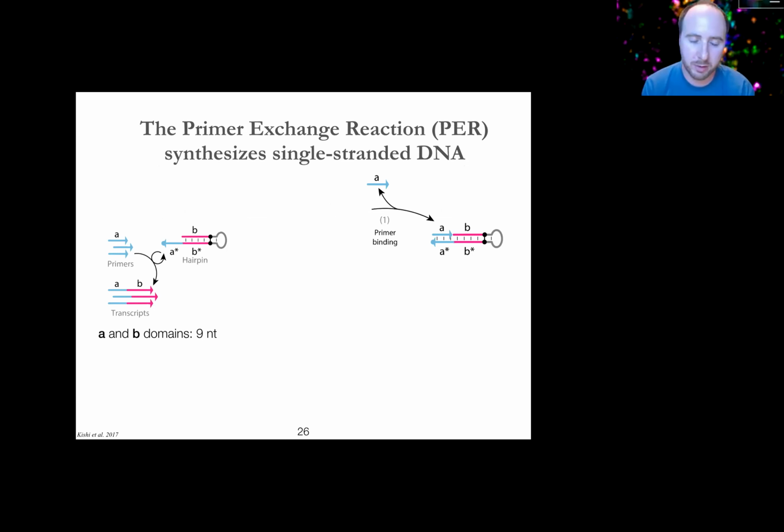And in order to explain the SABER acronym, for those of you that haven't seen Sidam's talk already, I have to throw another acronym at you first, so I apologize for that. But I do think this is some really cool molecular biology, and I never get sick of going through it, so I'm going to take you through it now. There's a reaction called the primer exchange reaction, or PER, that Josie developed based on some work that was going on in Peng's lab a couple of years ago as a way to synthesize DNA in defined ways.